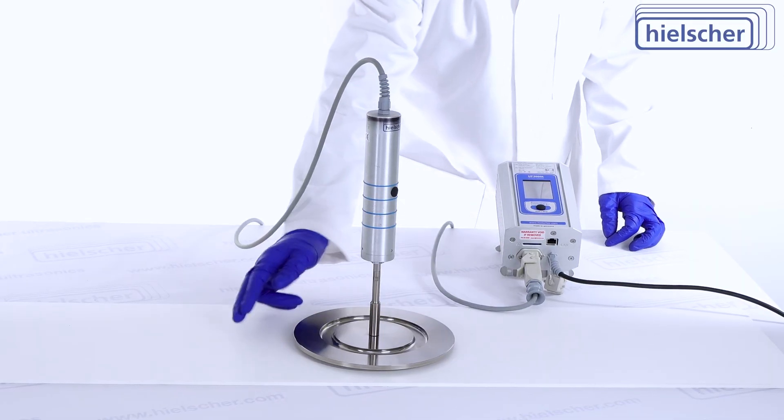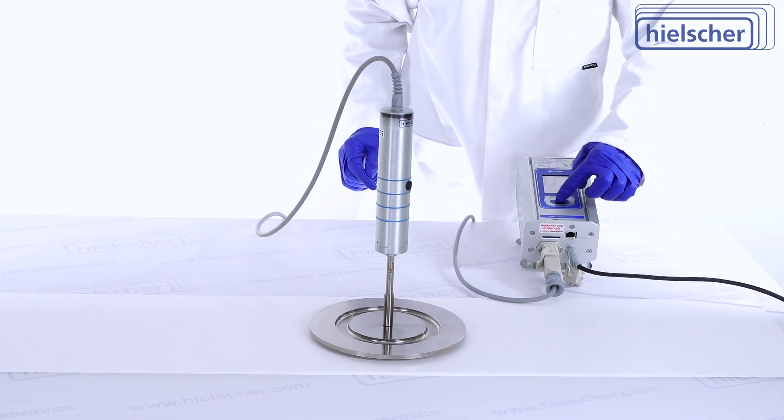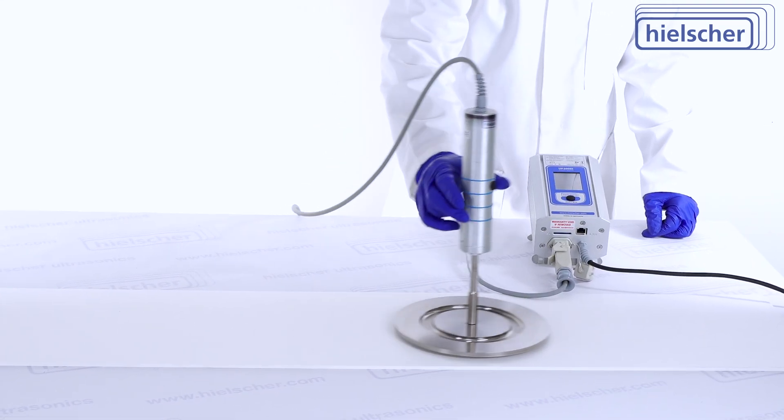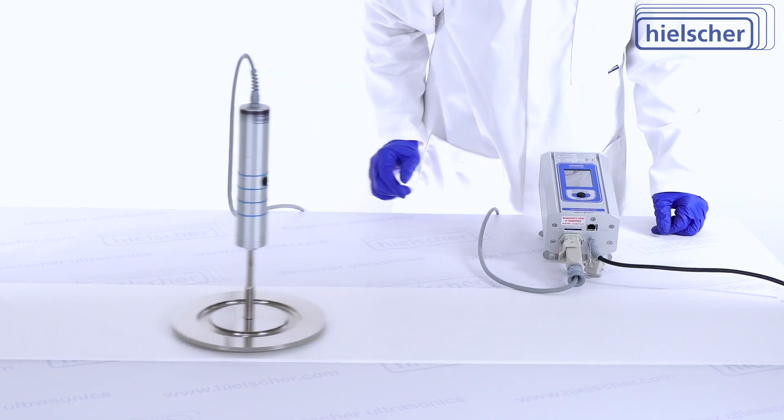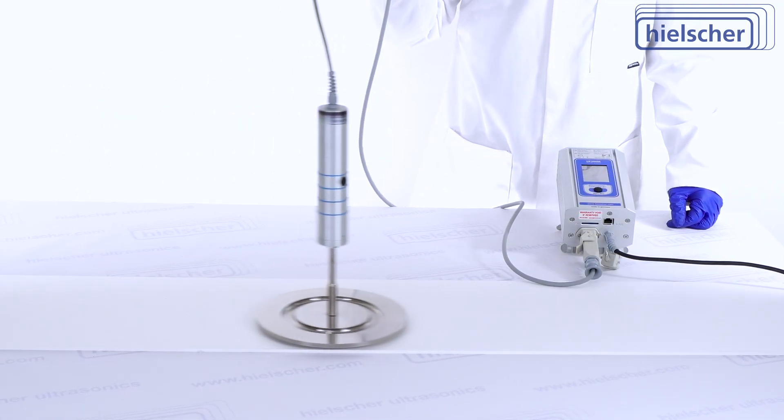Unlike experimental devices, the Hielscher Stepped Plate Resonator is a practical, readily available solution. It integrates seamlessly with existing systems, making it an accessible yet transformative addition to industrial workflows.